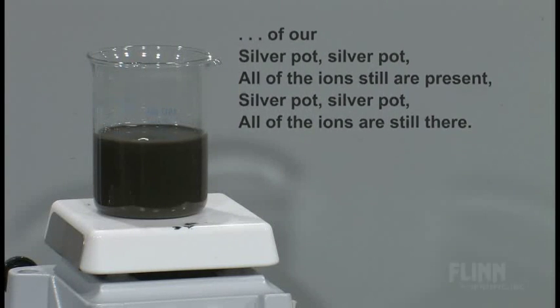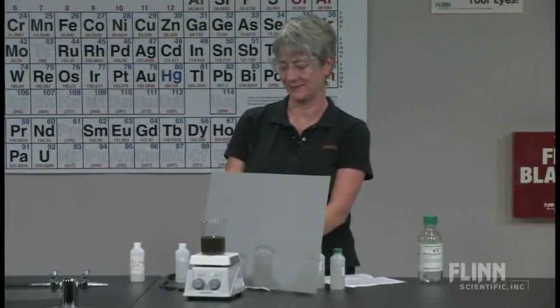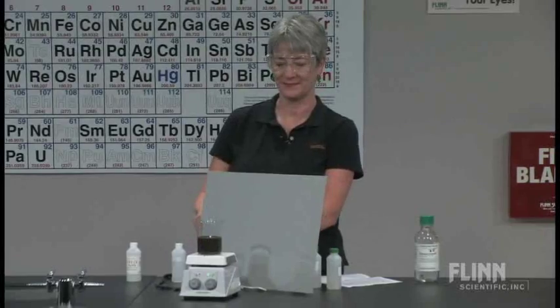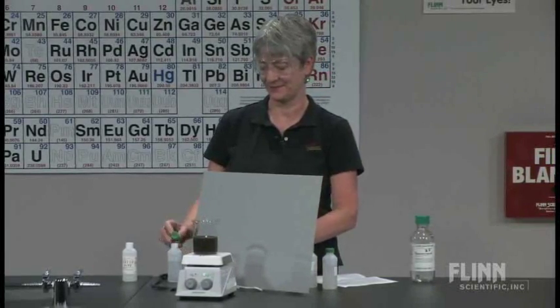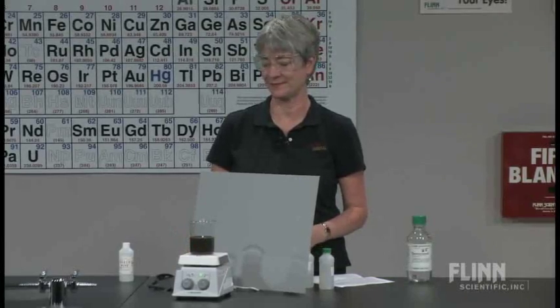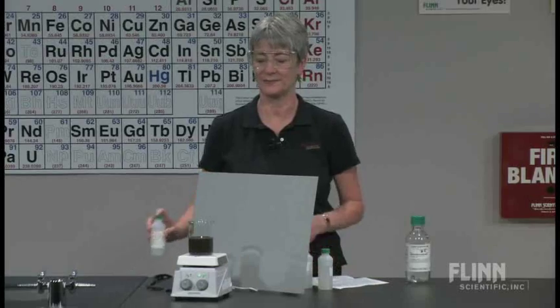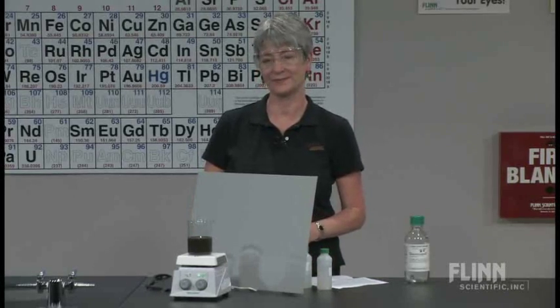Silver pot, silver pot, all of the ions still are present. Silver pot, silver pot, all of the ions are still there.